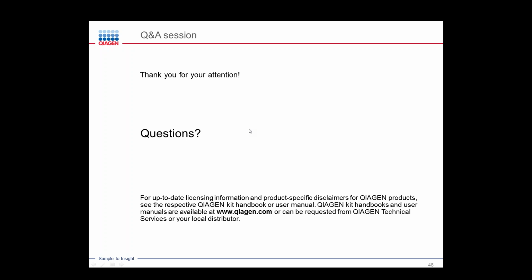Okay, great. Another question, this is a very specific one, I would say. The person wants to know what is the best sample anticoagulant. Is there a specific type for, if I understand the question, Eppendorfs for storage? Yeah. Okay, I think I got the question.